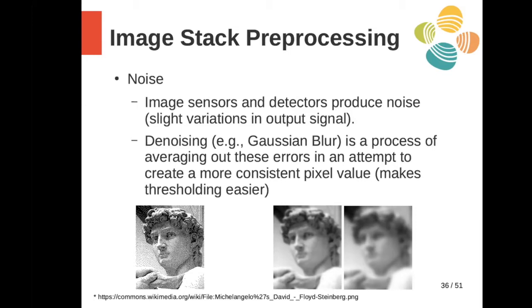But there are other techniques available that look for certain patterns. Pixel classification does this very well, which is one of the reasons it's an approach that we advocate. Even with these variations, if they have certain patterns, certain frequencies, whether high frequency noise or low frequency changes, or the angles in which they are, these can be used by pixel classification to identify different parts of the image.